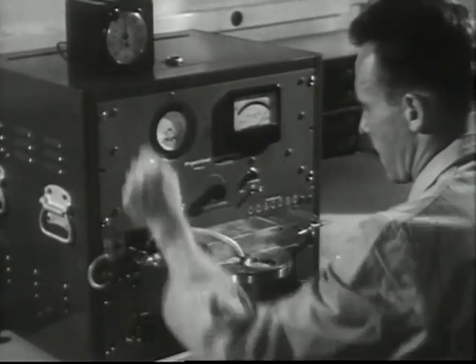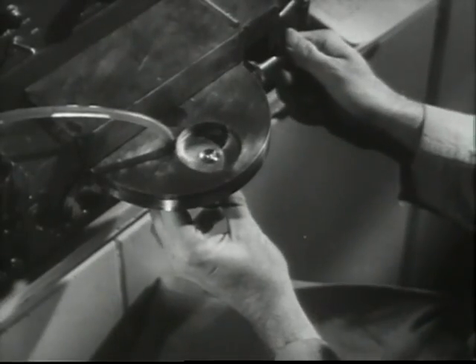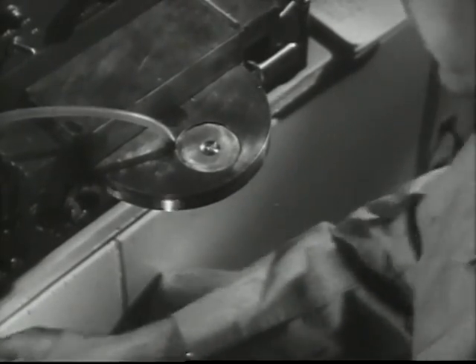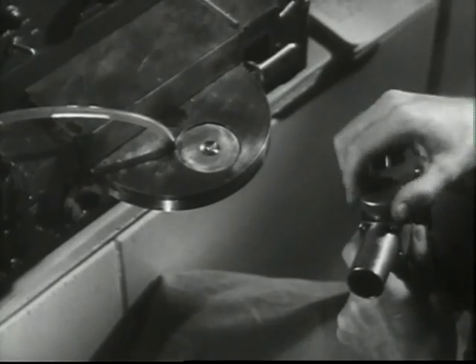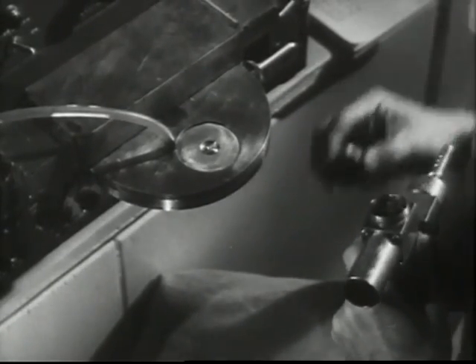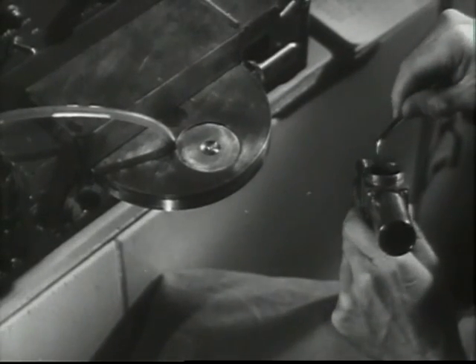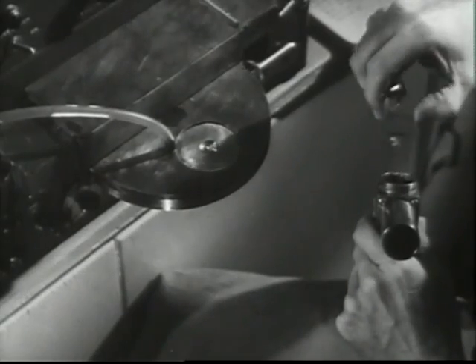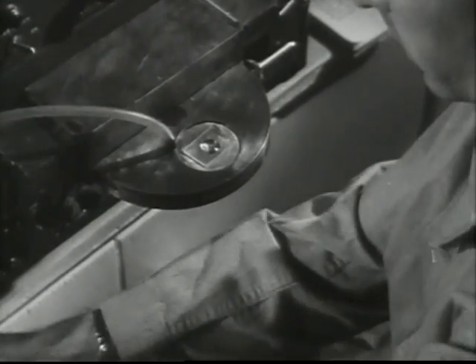Now comes the analysis of the dust. This is the first step in an elaborate survey which will determine the amount of radiation in the sample. The technician removes the glass slide with the dust clinging to the adhesive and places it in a radiation counter. By reading the dials on this machine, the engineer can accurately gauge the amount of radiation in the dust being breathed in by the machine operator.